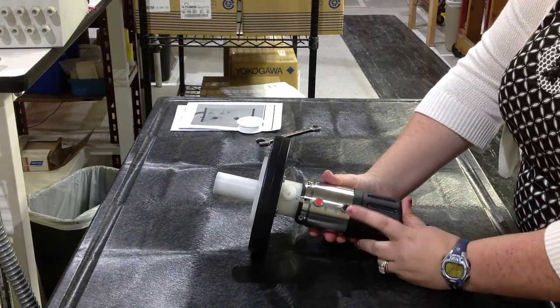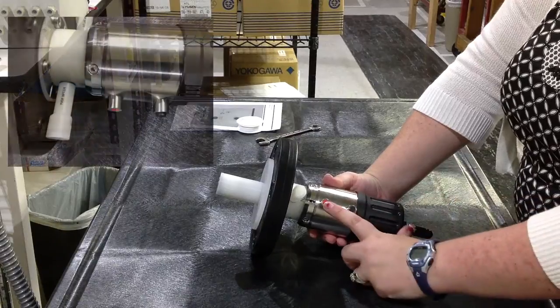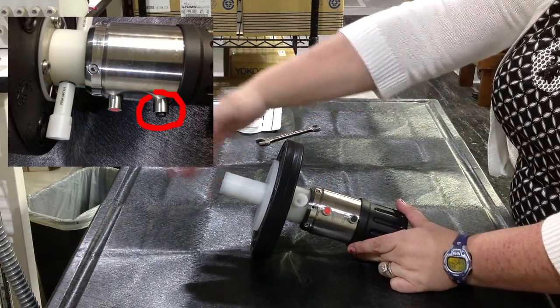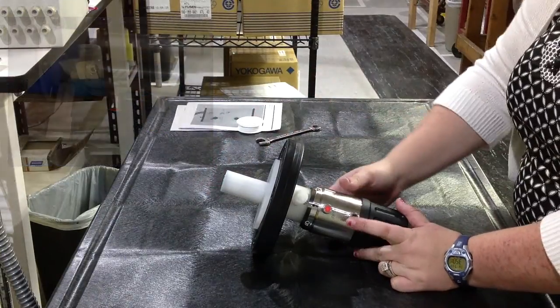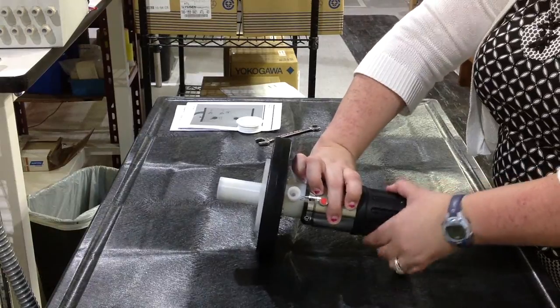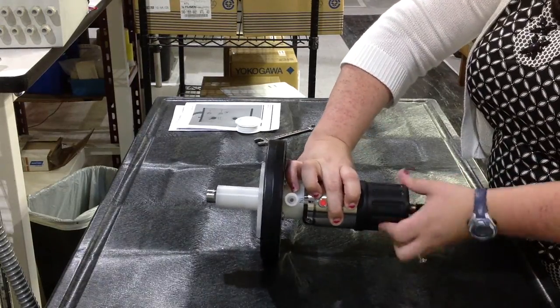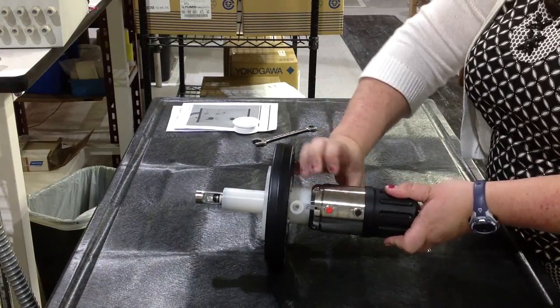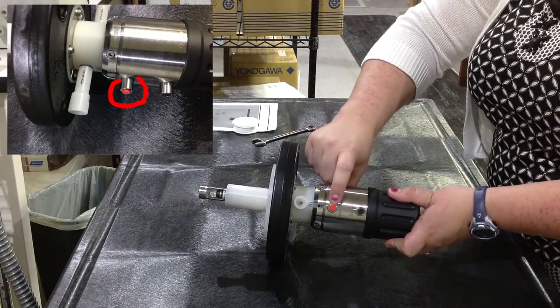On here you have two little lights. You have a black one that says 'service,' and a red one that says 'measure.' The service light is active because it's not in the process — it's in calibration or cleaning mode, so it's popped out. You simply press that in and turn the handle until it gets into measuring mode, and the red pops out.